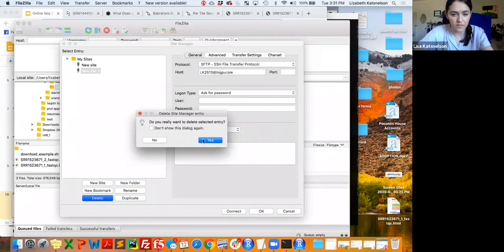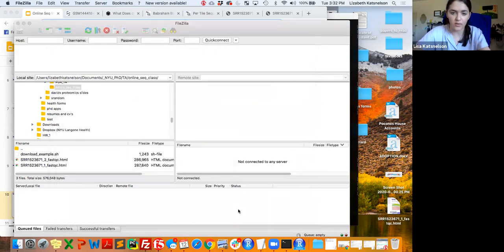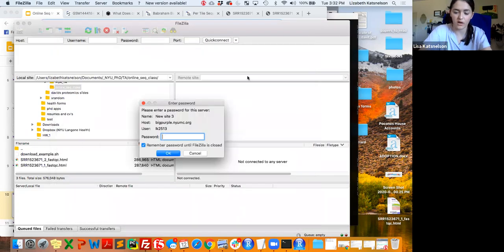Sorry about that. It's not your KID at BigPurple, it's just the BigPurple domain. The host is bigpurple.nyumc.org. I'm going to write my KID here. I want to tell it to ask for my password, and I'm going to tell it to connect. It's going to ask for my password here.